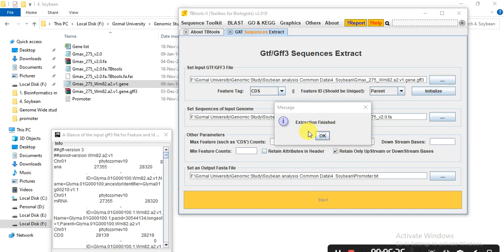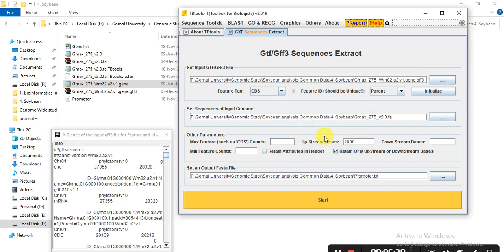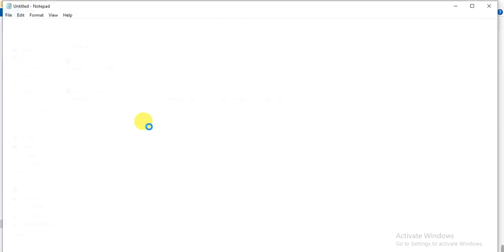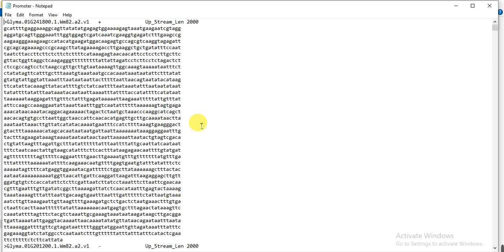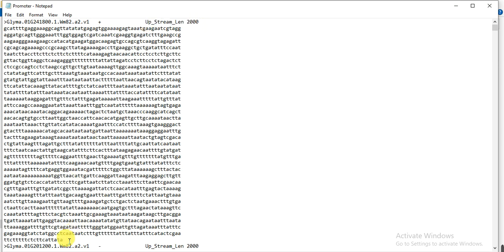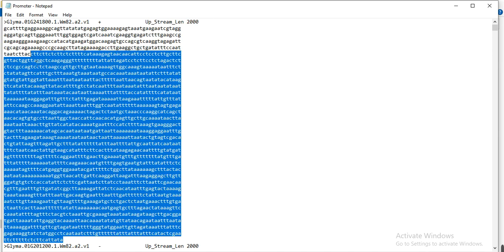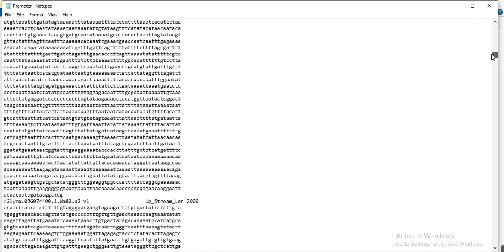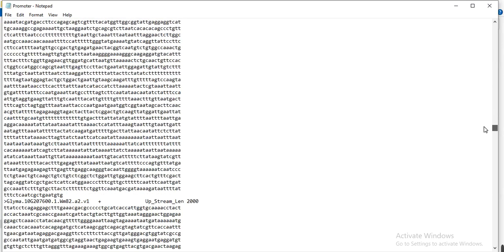When the process is finished you will receive the message: 'Extraction finished.' This is our output file and it is about 180 MB because it contains the whole genome's promoter region. We can check it by opening it. Here you can see the gene name, the strand information (positive or forward strand), the upstream region length which is 2000, and the actual upstream sequence bases — these are the promoter regions.